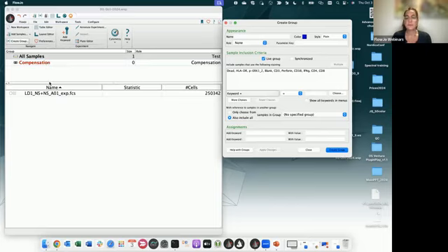Now, whenever we start an analysis in FlowJo, not only when we want to make a template, we should always create a group that mirrors our experiment. So let's say we have 3 different sets of samples: full stain samples, control samples, and compensation samples. Then we will have 3 different groups. So first thing, I'm going to create my group. Let's call it full stain.